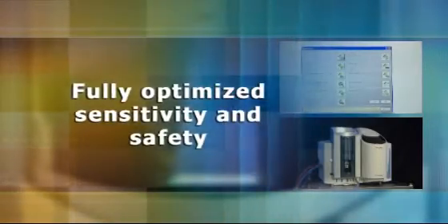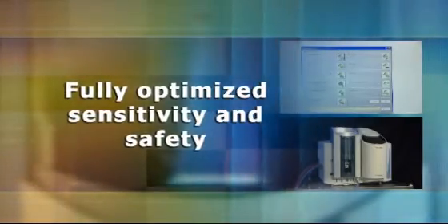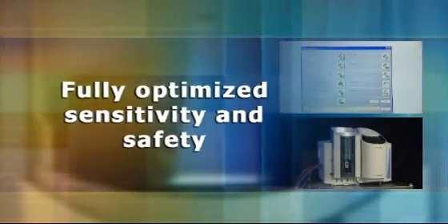With these automation tools, the ICE 3000 series provides optimised sensitivity and safety for your laboratory analysis.